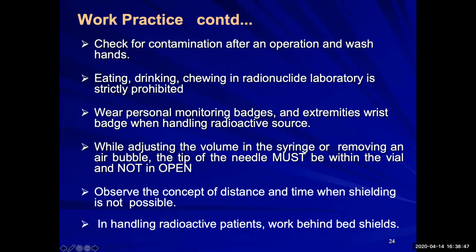Check for contamination after an operation and wash your hands. Eating, drinking, chewing anything inside the laboratory, the hot lab, is prohibited. Wear a personal monitoring badge, TLD or other, just to measure the dose after a while. When adjusting the volume in the syringe, preparing the dose or removing the air bubble, the tip of the needle must be within the vial and not in the open, otherwise you're going to contaminate the area you are working in. Observe the concept of distance and time when shielding is not possible. In handling radioactive patients, work behind bed shields.